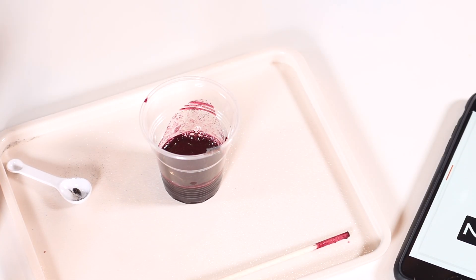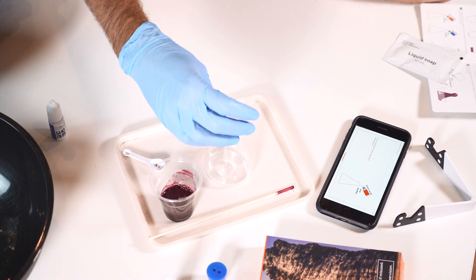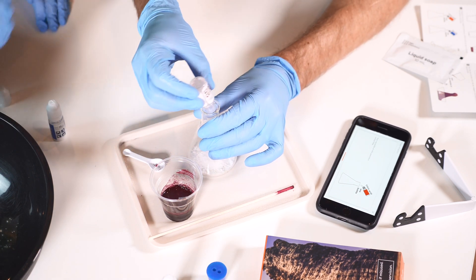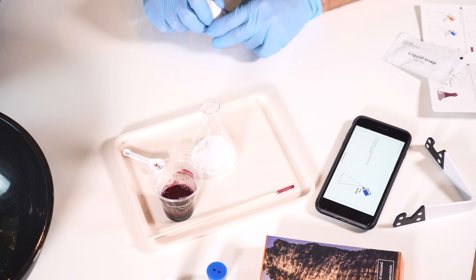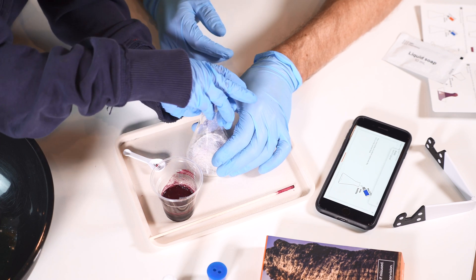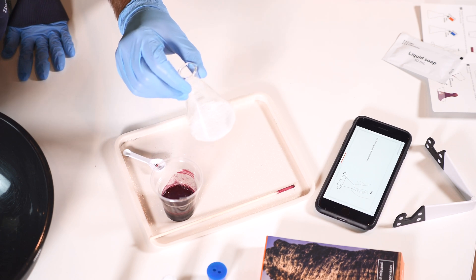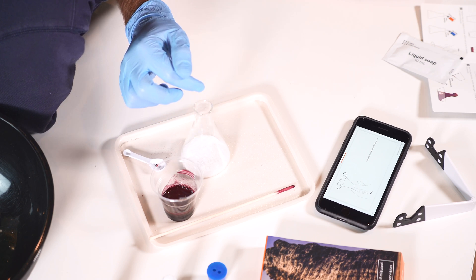Prepare the dry reagent mixture, which will act as a source of carbon dioxide. Pour one bottle of citric acid into the conical flask - the Erlenmeyer flask - we're going to pour citric acid in. Don't drop the whole bottle in there. The granules are just falling in. Citric acid. Pour one bottle of sodium carbonate, Na2CO3, into the conical flask. Mix the reagents in the conical flask. This is why you want an Erlenmeyer flask - you can slosh things around in it and it won't spill at the top.